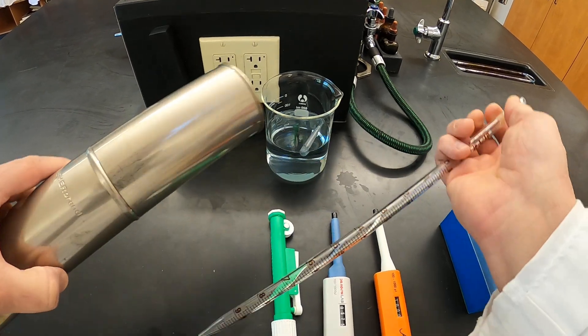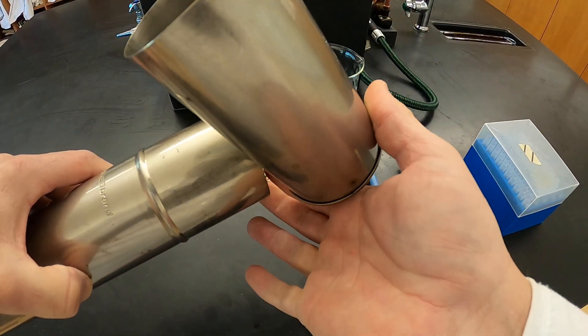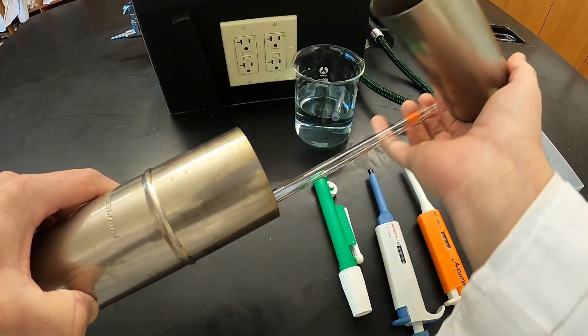Let's compare this to another type of pipette that we'll take out.